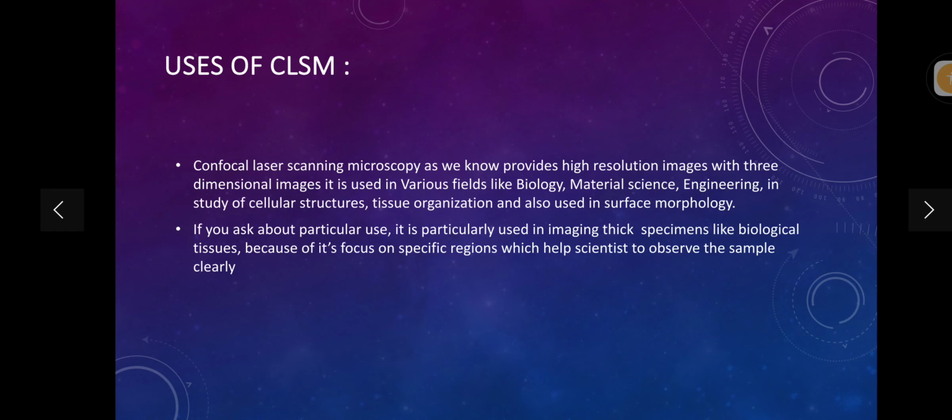Like that, the focus of the confocal laser scanning microscope is so strong that it focuses on a specific region, a perfect region, and we can change the region to know more about the thing, biological resources, tissues, cells.